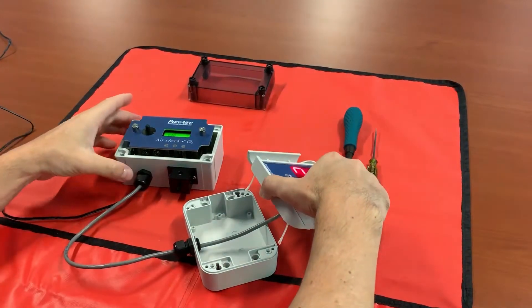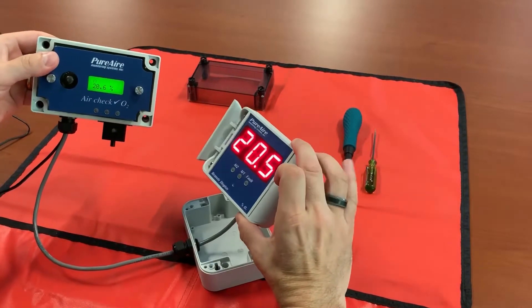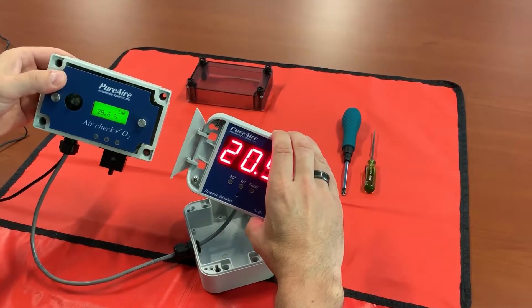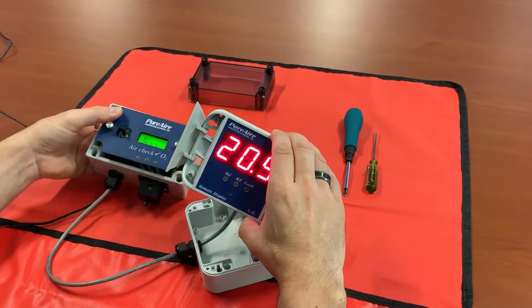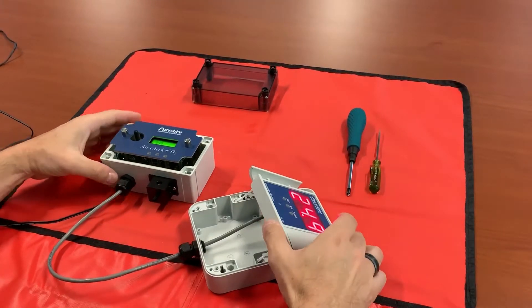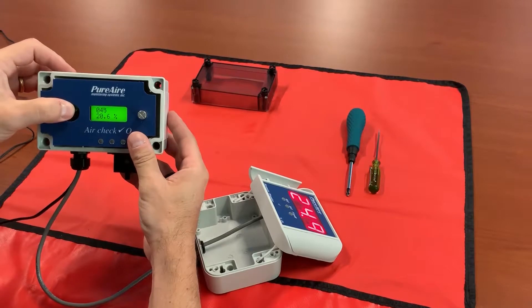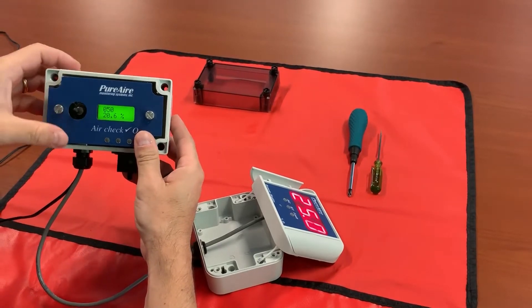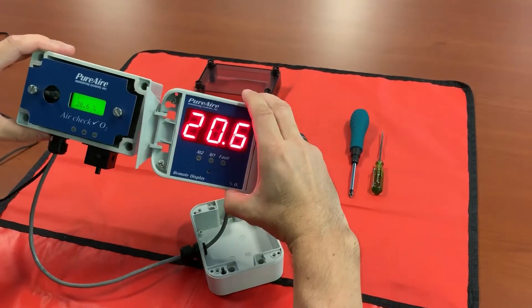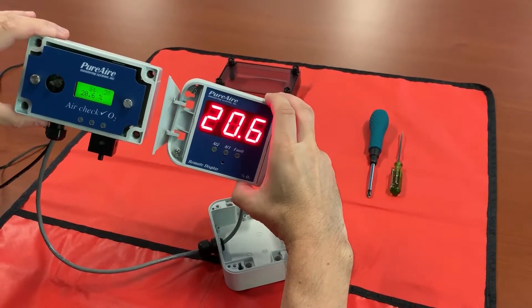At that point we've set our span. If you go out you can see we've set them, but they're still a little bit off, so this is where we have to do our fine-tuning adjustment. Go back into your 20 milliamp menu and adjust that number up — let's go up by 10, so rather than 40 we're now at 50. Exit out of there and now you're giving your oxygen reading — it's 20.6 on your monitor.